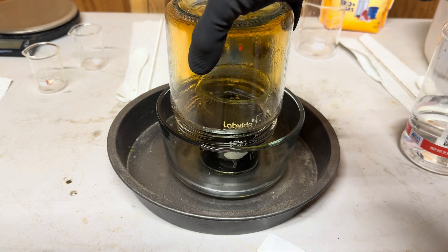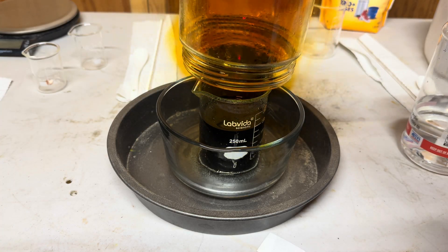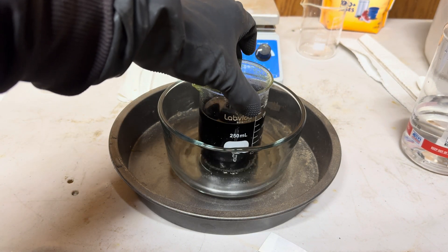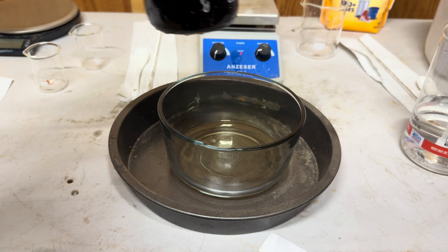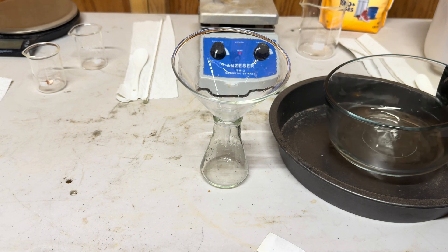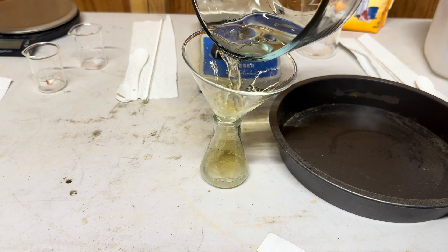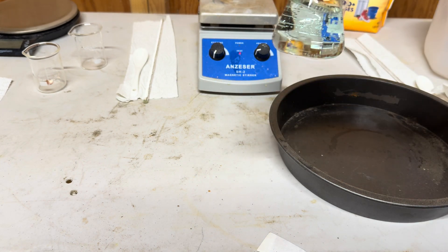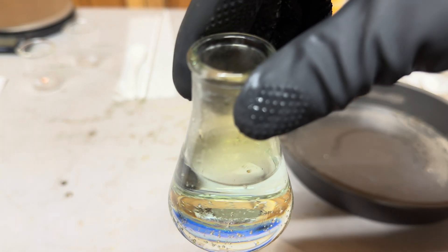It's been an hour and now we're going to take out both inner containers and pour out the nitric acid. Here is the really weak nitric acid, but it works. It's a little green because it is contaminated with the reaction mixture that had splashed out.